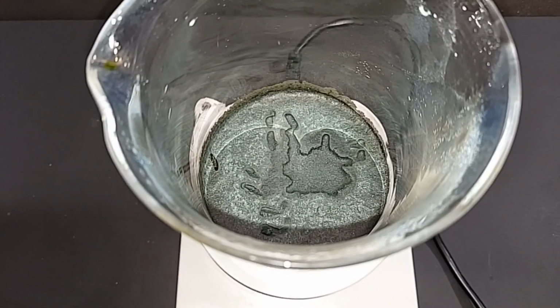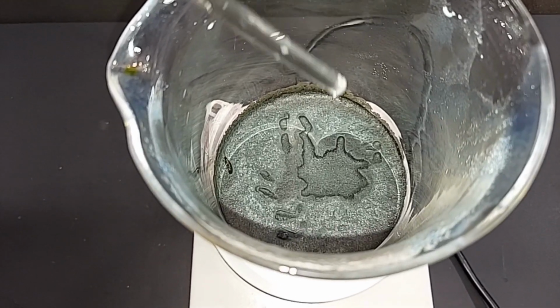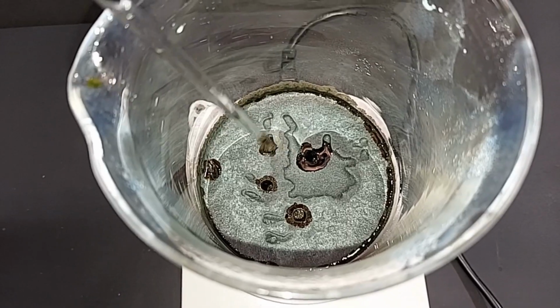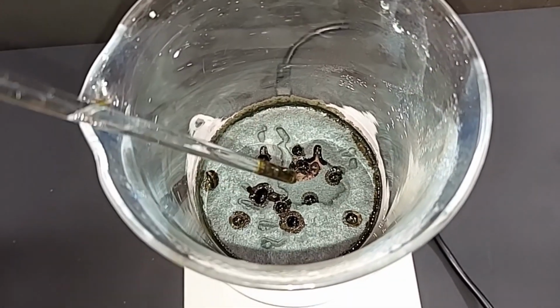I'm pretty sure it's crystallized as far as it's going to get. Those little marks there, I had to pull out the magnetic stir bar before it got to be solid. So I haven't poked into here yet. So there's still some liquid in there. Okay, no problem. Next step here, filter this stuff.